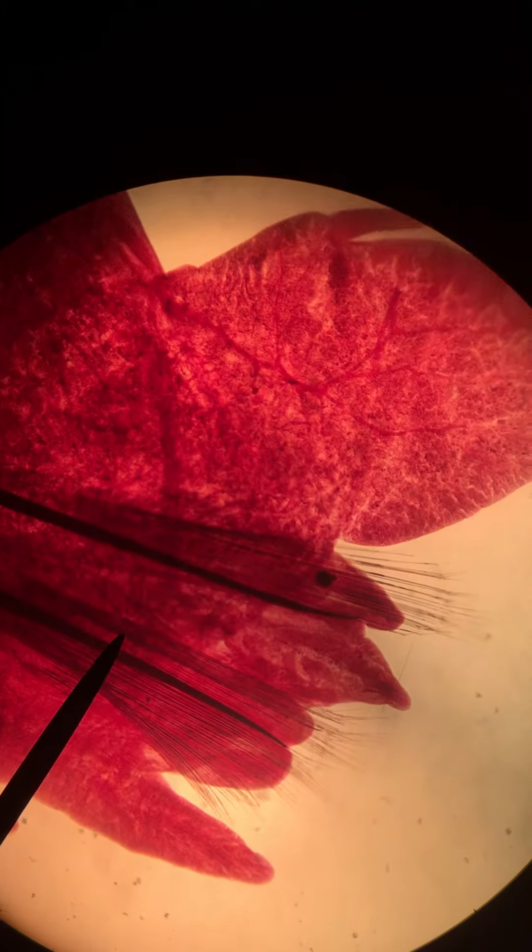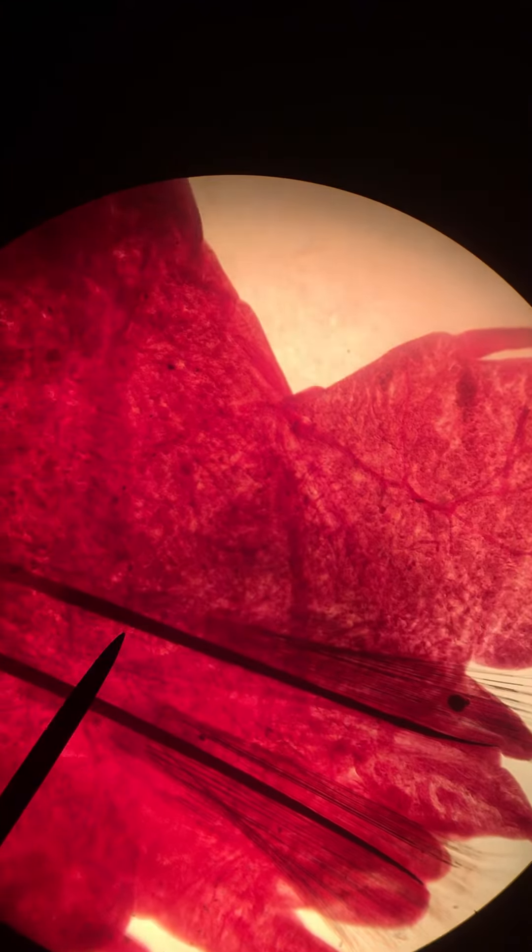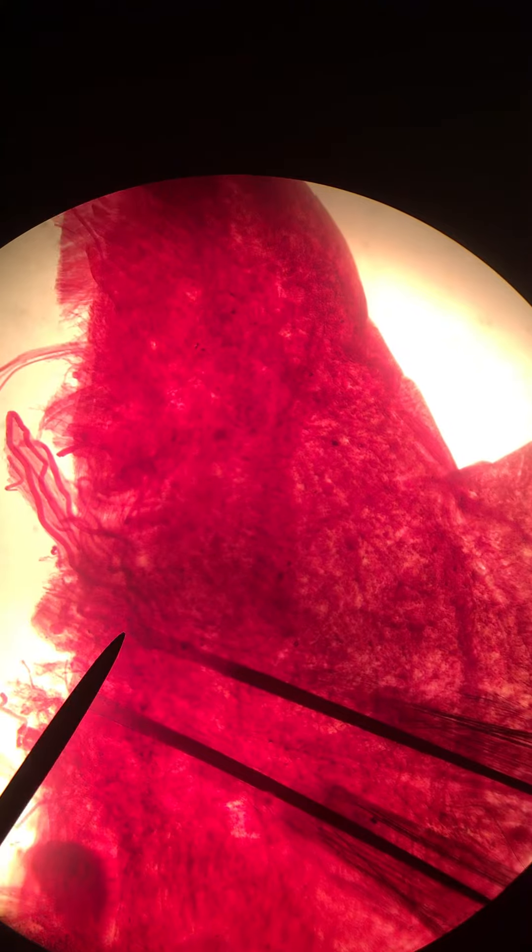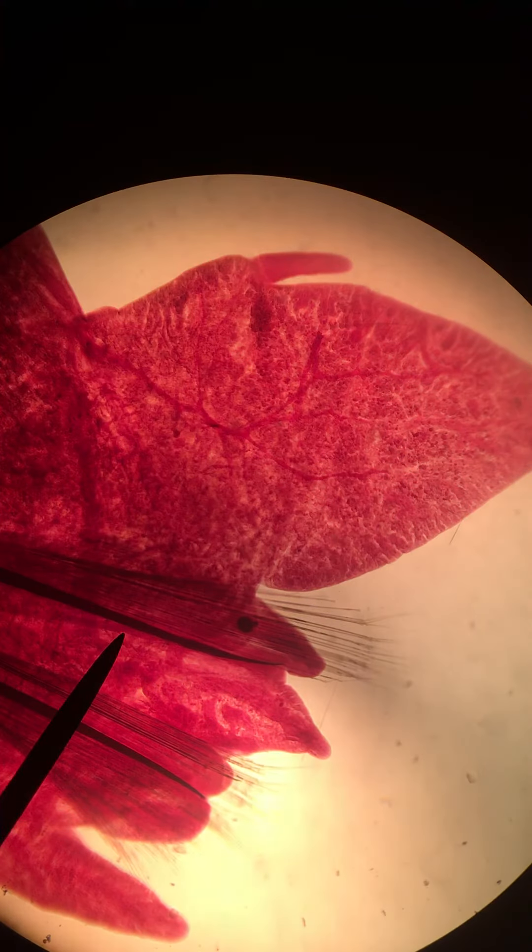Hi Gen Bio, Dr. Frey here. I am now showing you the slide that is our Nereis parapodium.